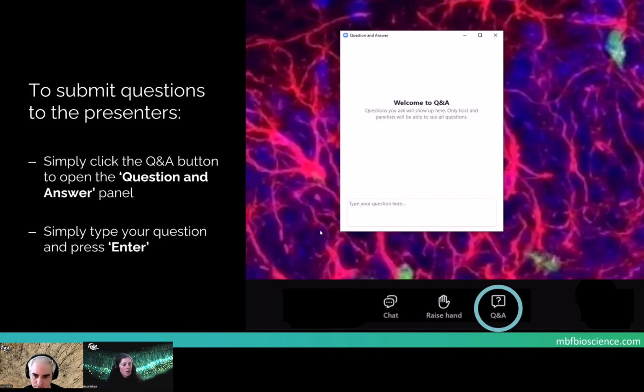And then there's also a question wondering, besides cells, can the software count axonal boutons? If it's something that we can train, then it is something that we could count. So definitely please get in touch with us and we can see if we can develop a classifier for that.